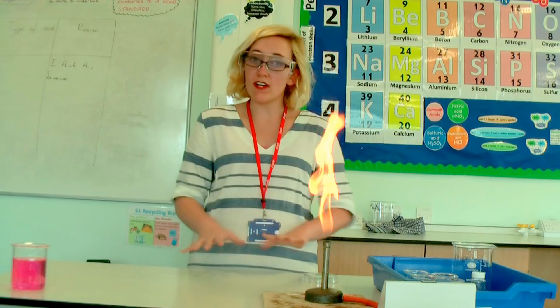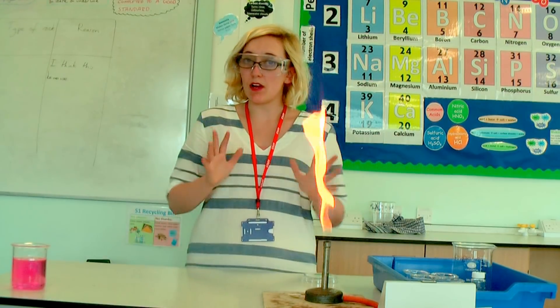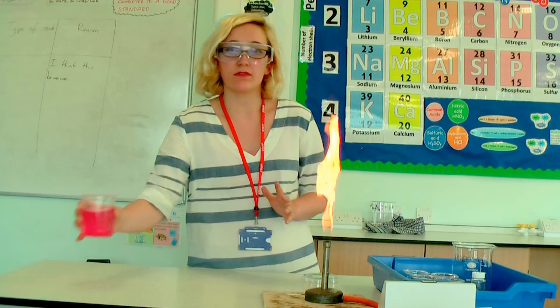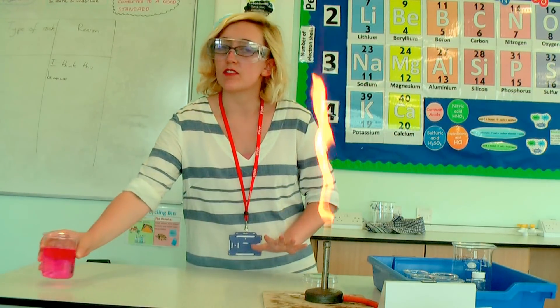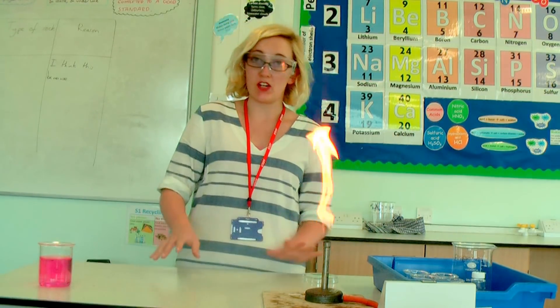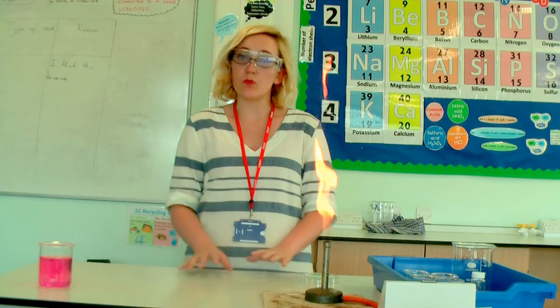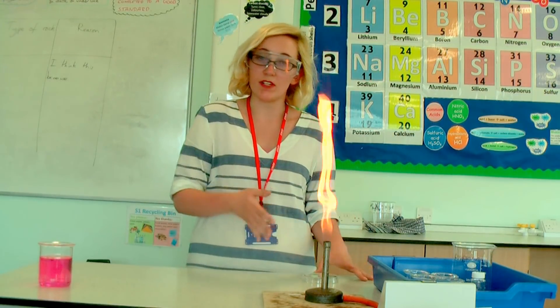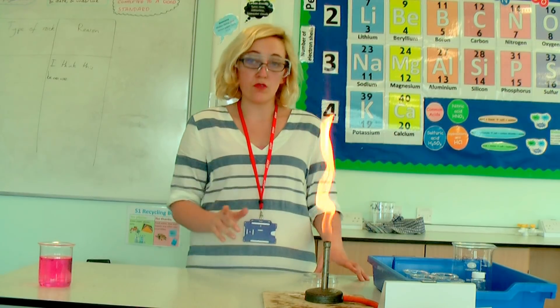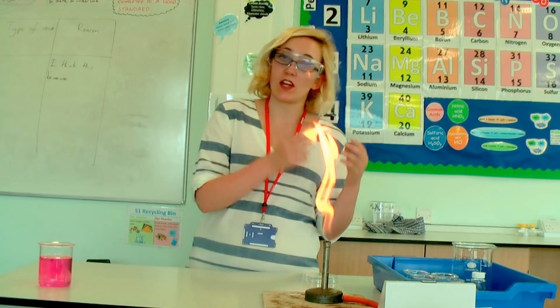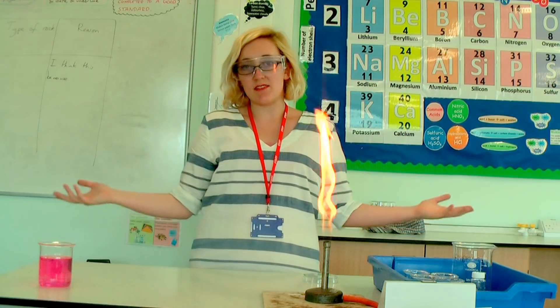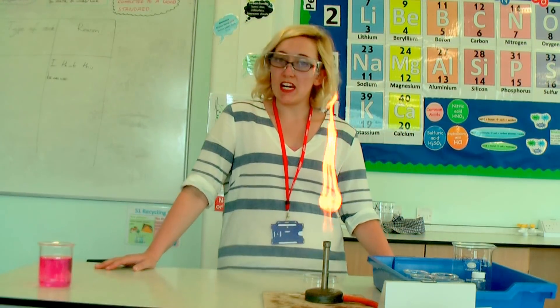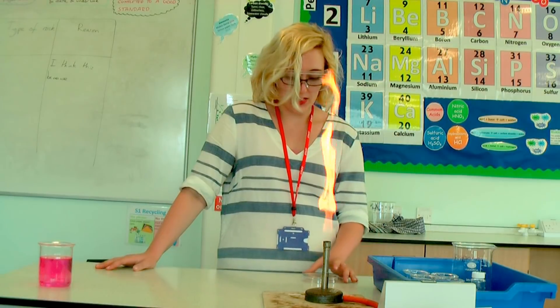I have already wiped down my desk and my hands using disinfectant. It's very, very important in this practical that we avoid contamination — we don't want any bacteria from our hands, from ourselves, or from desks getting into our experiment. At the same time, we do not want to spread any of the E. coli we're using into the environment, because it could make people very ill.